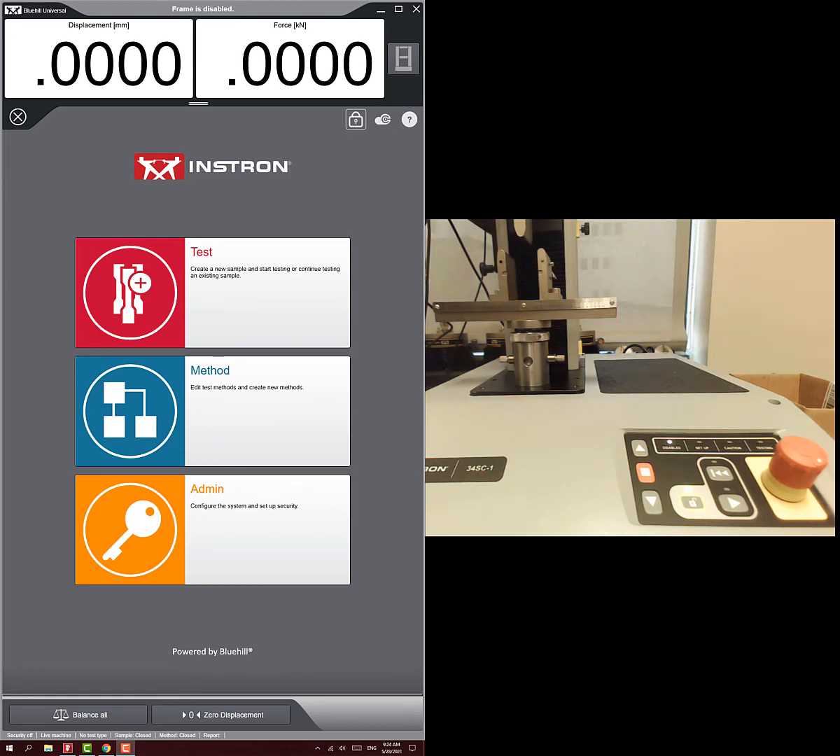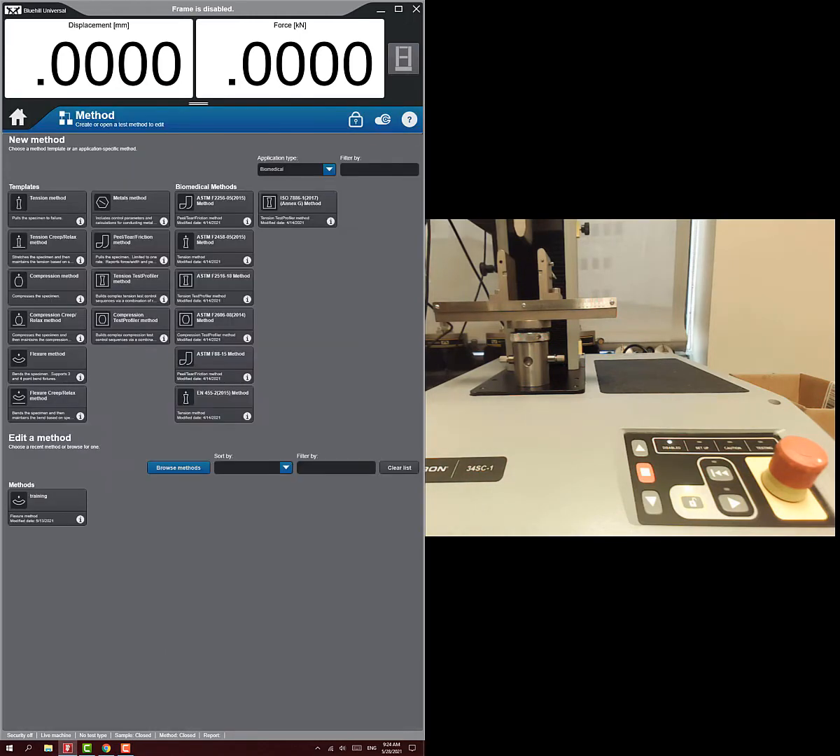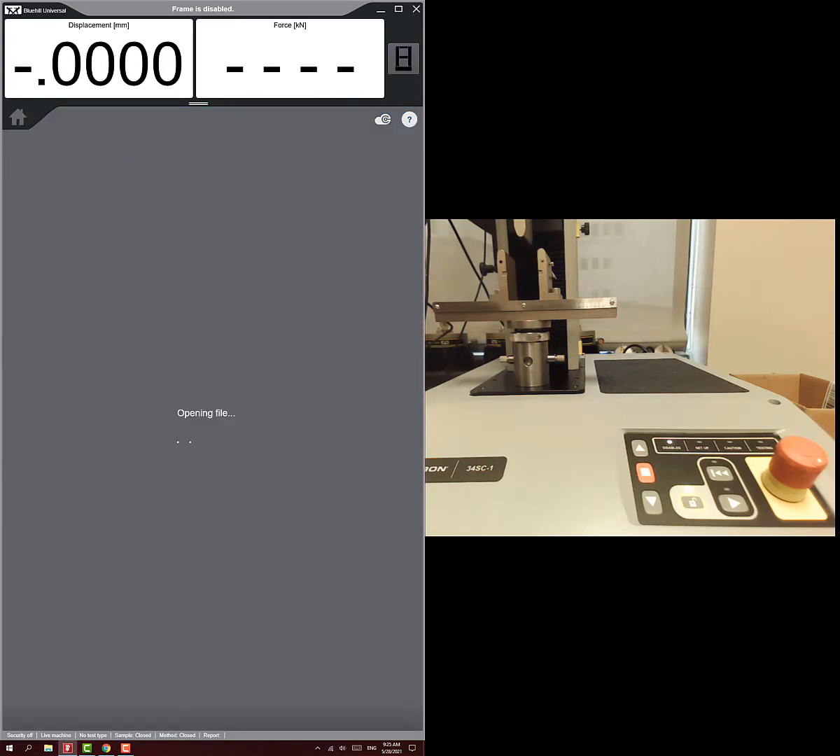Let's get right into doing the test. I'm going to show you how to set up a three-point bending test on this stainless steel rod. The first thing you have to do is create a test method. If you go to test methods there are a lot of methods, but for testing something like this we can either use the compression method or the flexure method. We'll just choose the compression method to keep things as simple as possible.